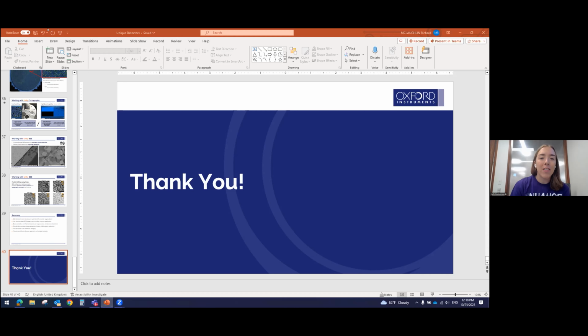Gotcha. Okay. Thank you very much for your answer. Still waiting on a couple of questions. I can give it another minute or so in case people are typing, but please be sure to put them in the Q&A section. I guess I kind of have one question. Oh, there's one more. Perfect. So why do the K series counts drop off with a low voltage faster than the L series?